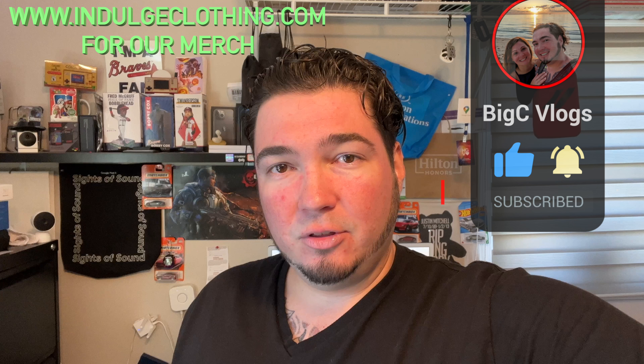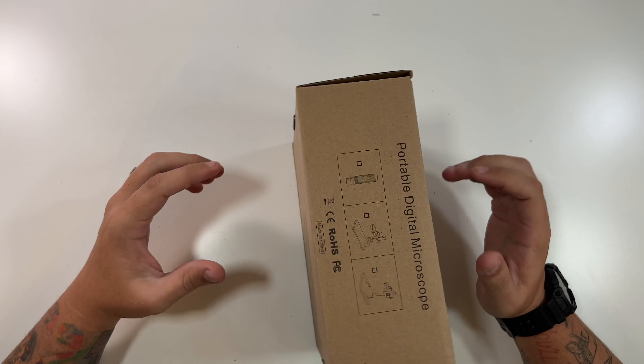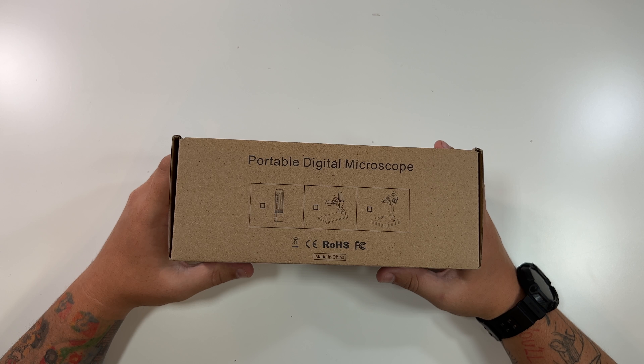This microscope can work with Windows or a Mac, and it can also work with a cell phone. It has an app that you connect to in order to view what you're zooming in on — the app screen is how you see it. We're going to get on the overhead rig, unbox this, set it up, put something on it, zoom in, and show you how it works.